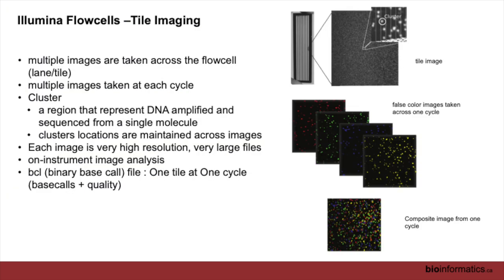So Illumina, Bernard's described this in great detail. I'm going to focus on this a lot too. This is the primary data that we work with in the genomics program. So basically what we're doing is imaging of tiles with Illumina flow cells. Here's a representation of a flow cell here. And you see this little area here is a single image that's taken.